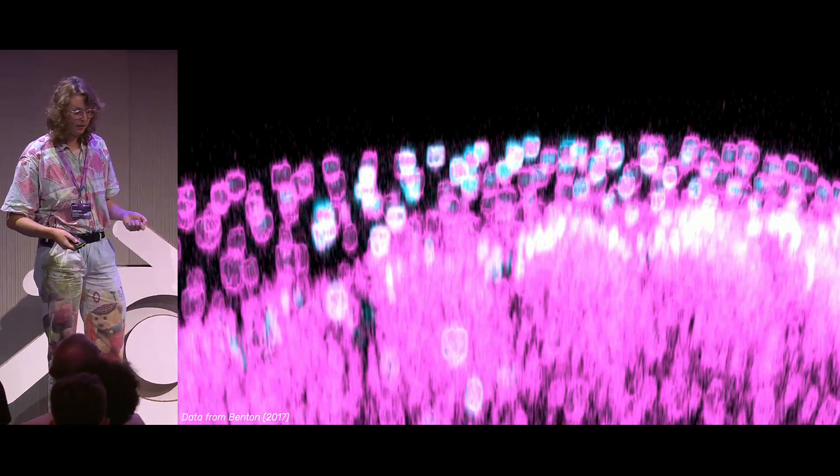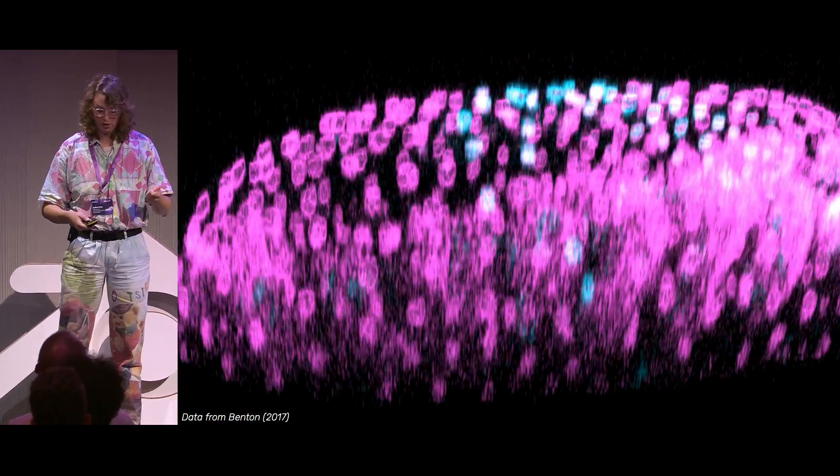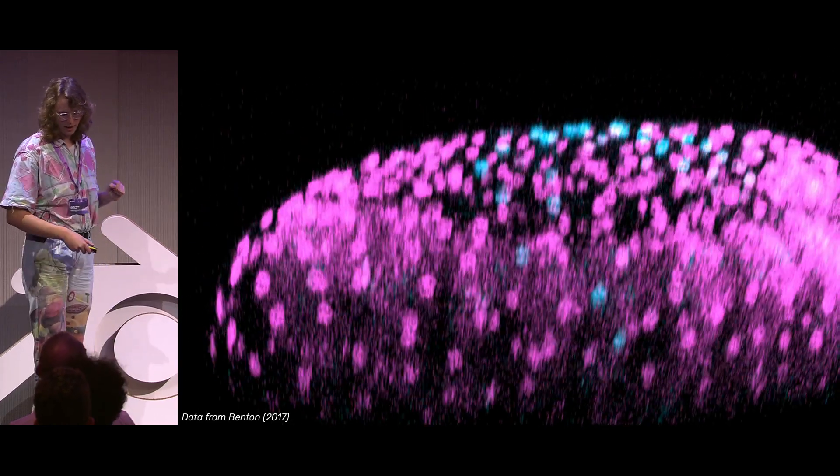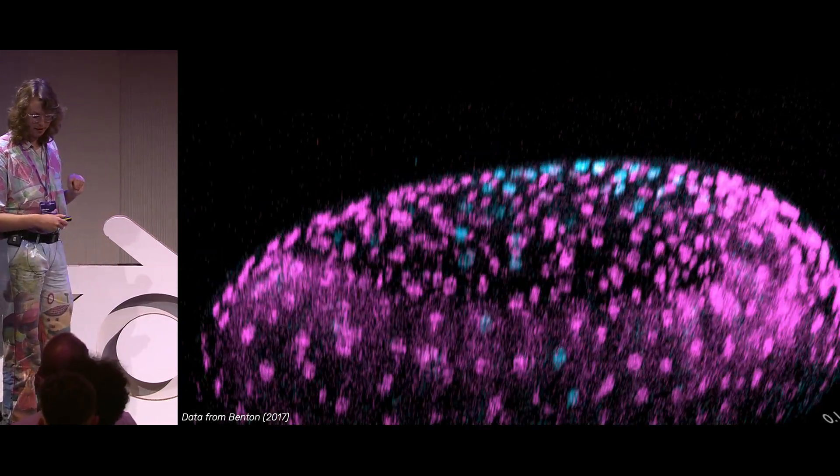Similarly, a different question that a lot of people are interested in is development. How do we go from a single cell, a single nucleus, to lots of different ones with a full body plan? This actually requires us to do this time-based imaging where we have 3D, multiple channels, and time, and so this is a developing beetle embryo where we have different cells labeled in pink and cyan.